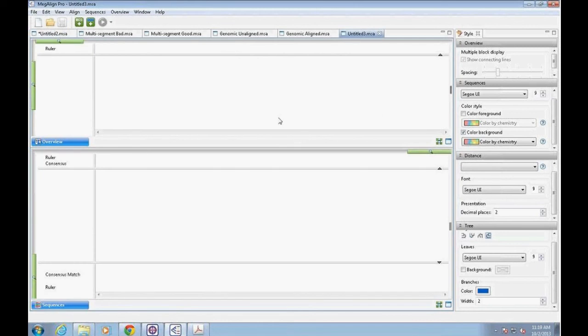And as a little background on this second workflow here, sequences that consist of more than one chromosome, contig, or fragment are called multi-segment files. So let's say that you want to string together the consensus sequences from all the contigs in an alignment, or chromosomes in a genome, or exons in a gene. Now, if you simply added these sequences as we did in the previous workflow, you'll end up aligning these parts to one another. Now, instead, we need to enter in the sequences using a different method to make sure that the entire set of sequences in the multi-segment file will instead be treated as an end-to-end concatenation.